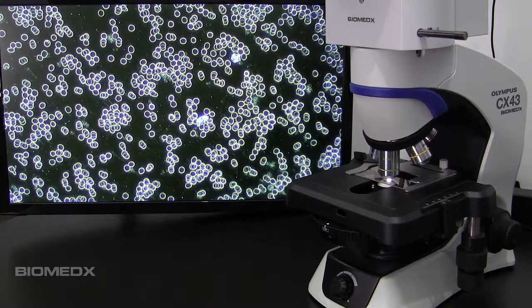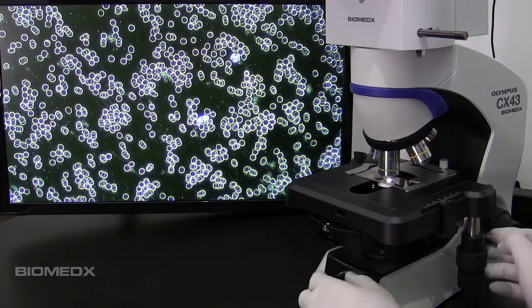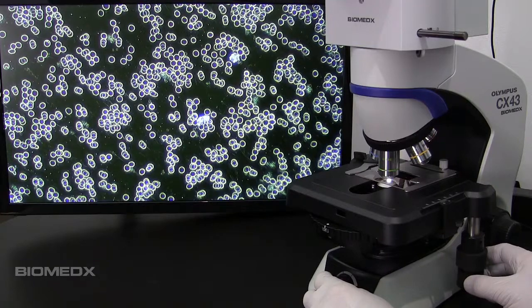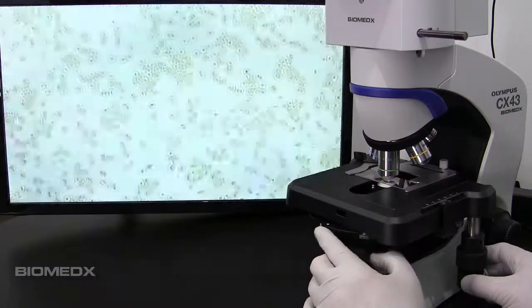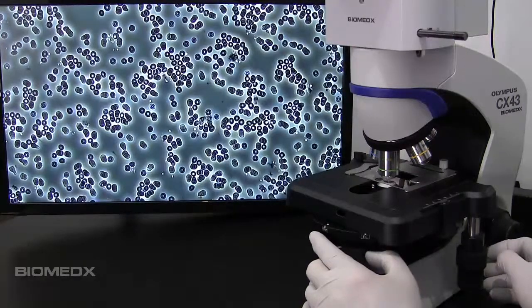Darkfield live blood analysis is a popular phrase in some circles when they engage clients in looking at their blood under the microscope. Live cell qualitative auditing is probably more appropriate where we are concerned because there is so much more we can do with our scopes.